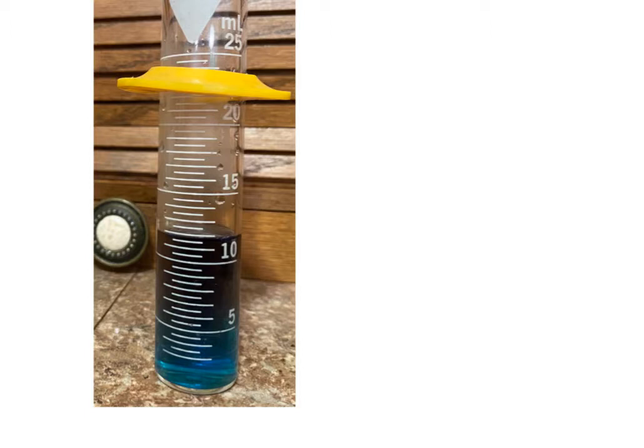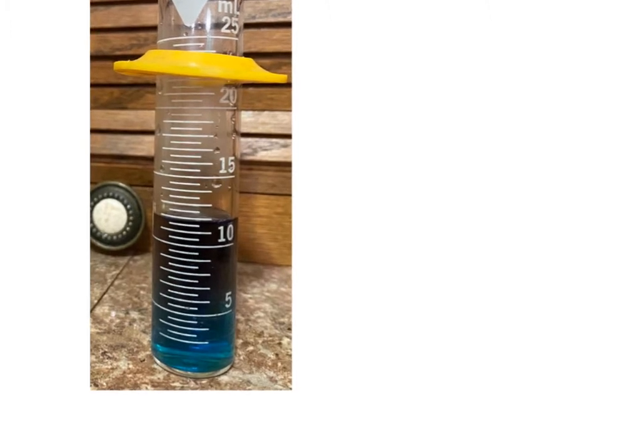Everything that we're going to do for this first set of labs centers around this graduated cylinder. If you notice, I've got two different liquids in here: some water, to which I added food coloring so that it would stand out a little bit, and some ethanol, which is up here. As you notice, these two liquids are stacking on top of one another.